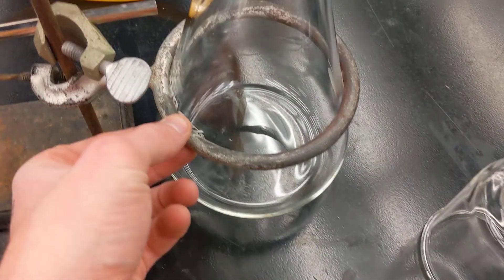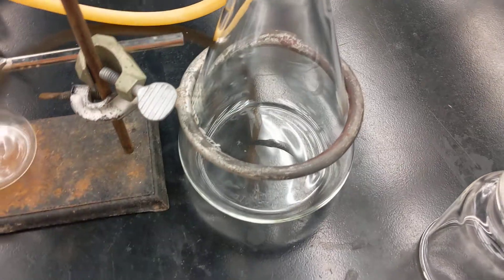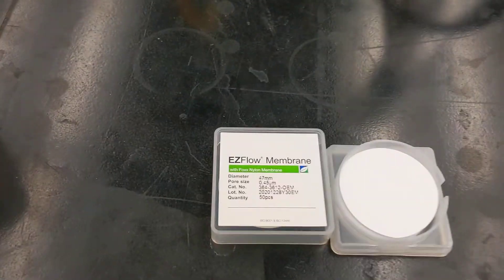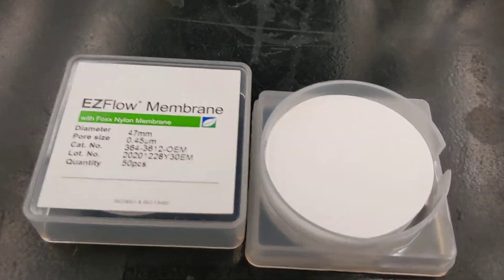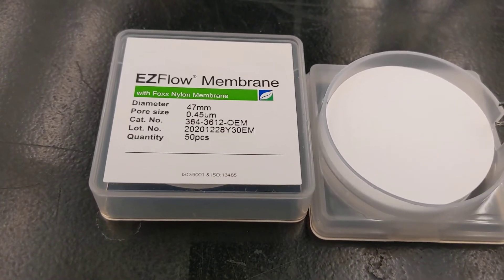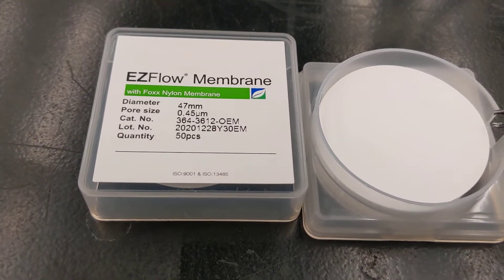Make sure that your flask can't tip over on this ring here. Then we'll take a 0.45 micron nylon filter, typically. Unless you have a specialty need, then you may use a PTFE or Teflon filter.